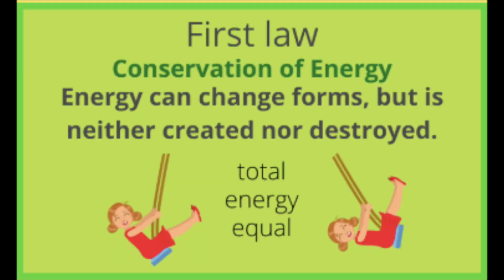Okay, in this lab, we're going to be looking at temperature changes in reactions to be able to determine if a process is exothermic or endothermic. Before we get to that, let's review the first law of thermodynamics, which is also known as the law of conservation of energy, which states that the energy in the universe remains the same.